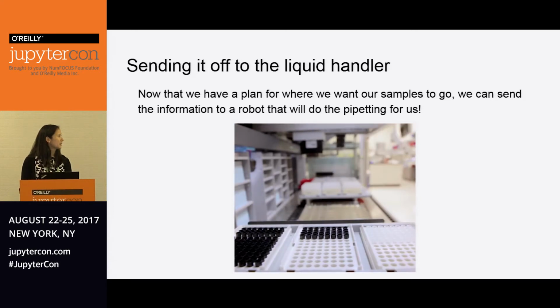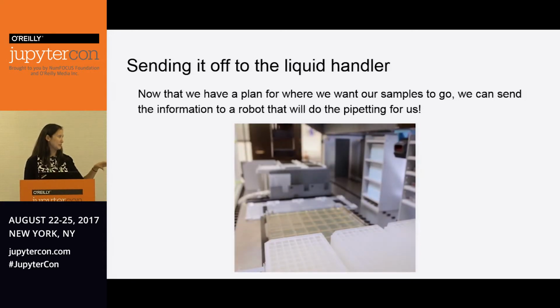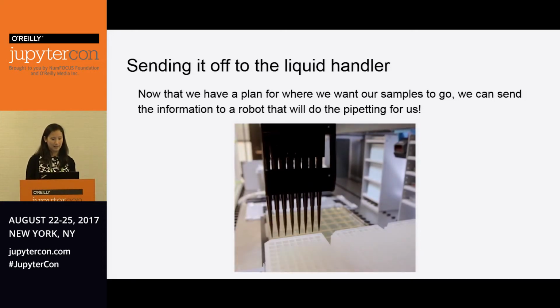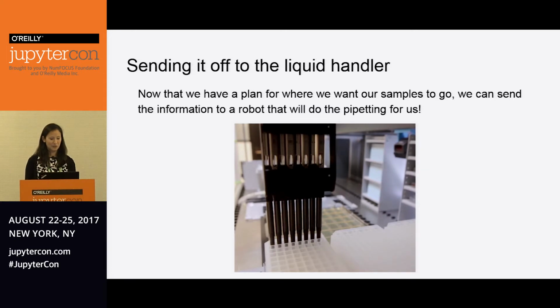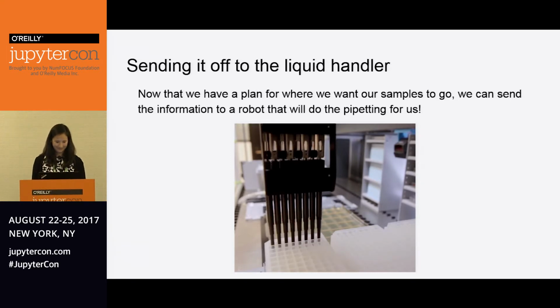So let's see, we'll go to the beginning. So right now it is getting rid of its old tips and putting new tips on, and then it will go over to the plates and do some liquid handling. So for all you biologists that have done manual pipetting, this is really exciting. It can, but that one in particular is not an example of one. I didn't have a good example.